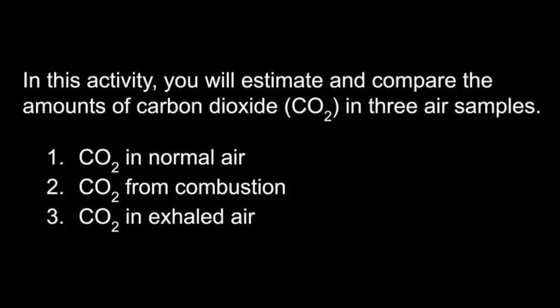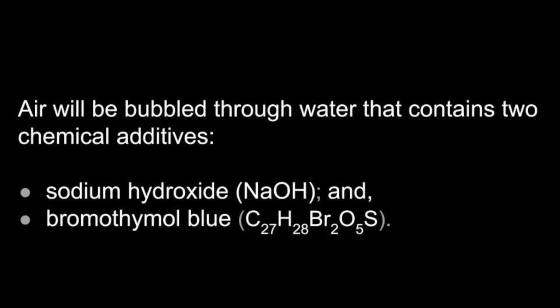In this activity, you will estimate and compare the amounts of carbon dioxide in 3 air samples. The first is carbon dioxide in normal air, second is carbon dioxide from combustion, and the third is carbon dioxide in exhaled air. Air will be bubbled through water that contains 2 chemical additives.